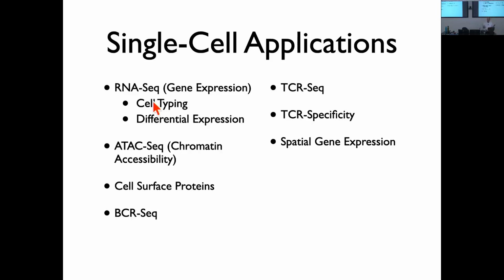So if you had just a blood sample, you might try to separate out the different types of cells that you'd expect to find in circulating blood, right? So like T cells, B cells, macrophages, things like that, and cluster them. And then you could, to some extent, look at those clusters independently. You might even have subclusters of different subtypes of T cells.